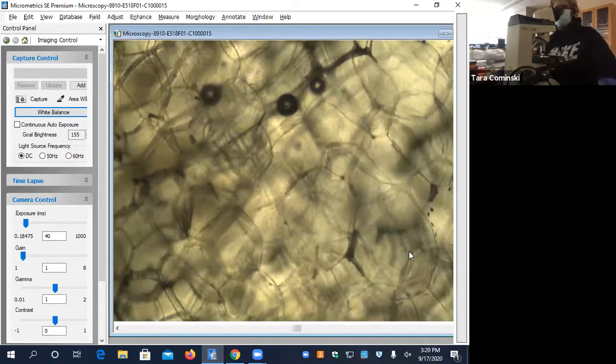I'm trying to zoom in. So it is going to be kind of hard because it's uneven. Sometimes you have to move it around to find where the thinnest part is and just get it in focus the best you can. I have this other slide, I'll show you that. Then make it better. Oh, it was here. Did Mo move it?